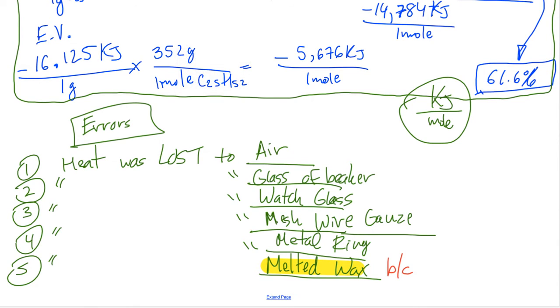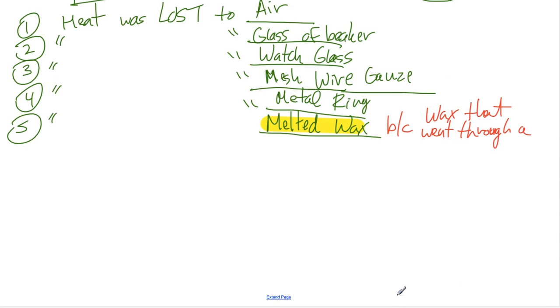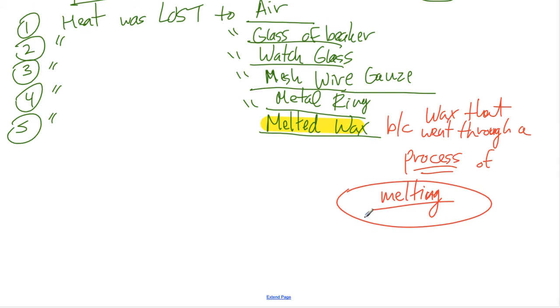It went through a process, and I would say the wax that went through a process. Let's get on this page a little bit. It went through a process, a melting process of melting, right? And that is different than going through combustion.